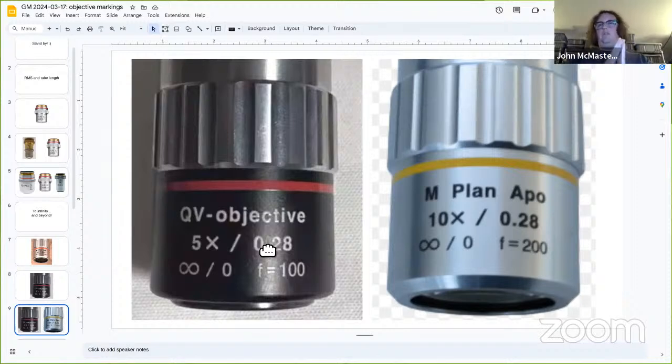In lieu of that fixed focus coming from the objective, the light comes out of the objective focused at infinity. But then in order to get a real image, you have to convert that infinity light to an actual finite distance, where it will actually, like I took my glasses here, you focus from the sun.